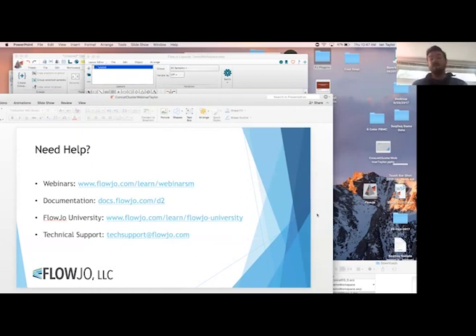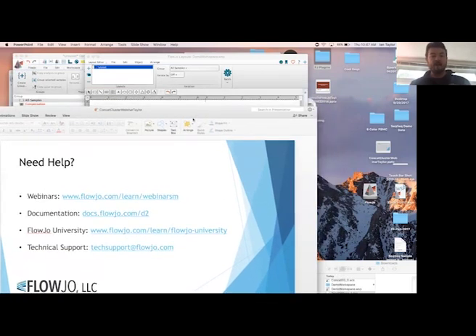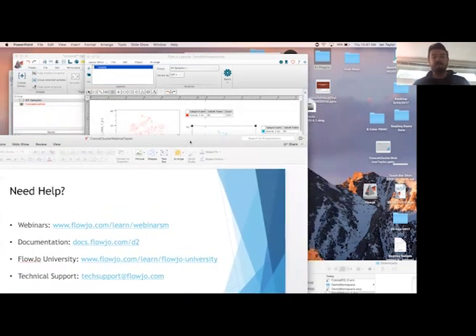It does have different color palettes for heat mapping. So if you were doing like a table of heat map, genes versus cells, then you could look at blue, white, and red scaled data. But you cannot change the color palette in FlowJo at this time. Unfortunately, no. Great question, though. It's an interesting one. Yeah, keep them coming. Just in the last few moments here.